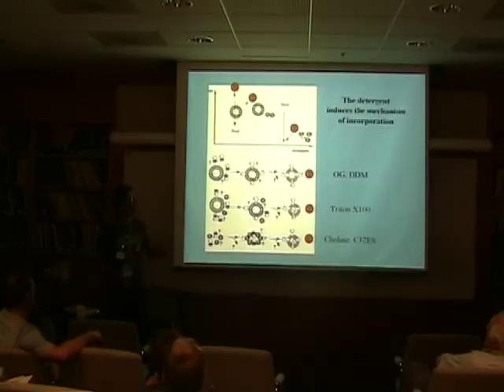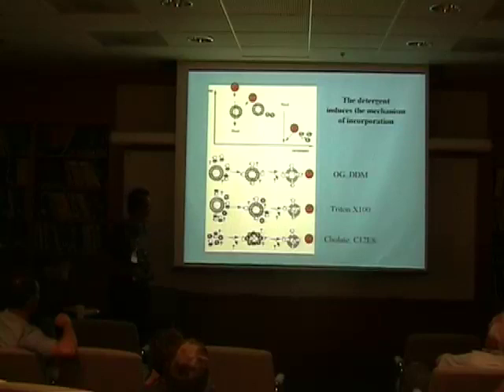Two slides. I completely agree with what Thomas said, the different steps that are important in practice and the way you do it in your lab. I just wanted to add some information that we have on the mechanism of 2D crystallization that may help in understanding what is going on.